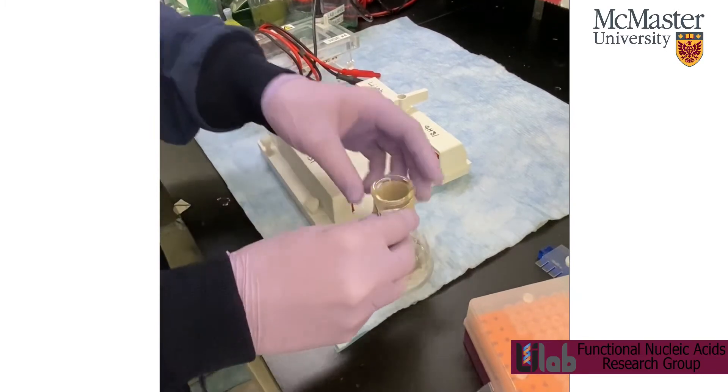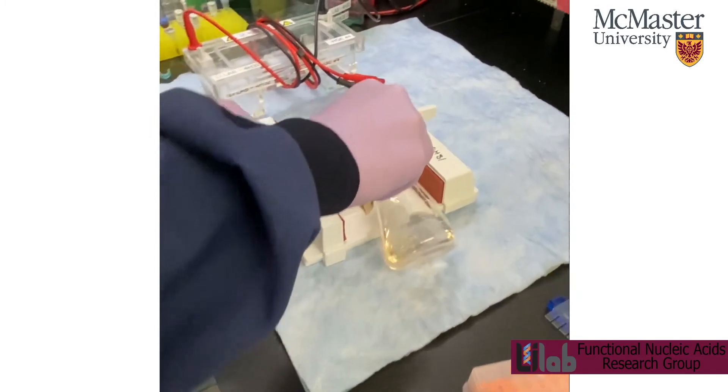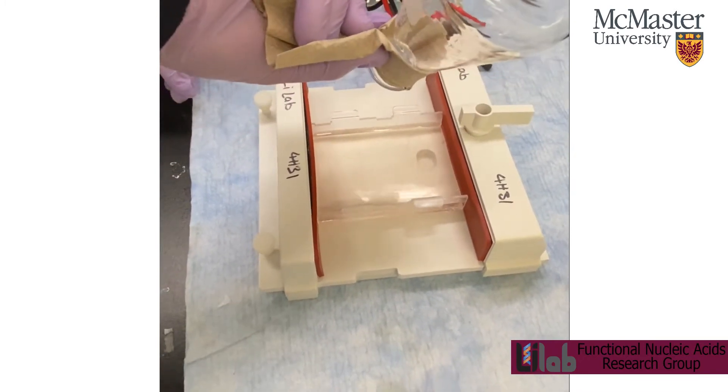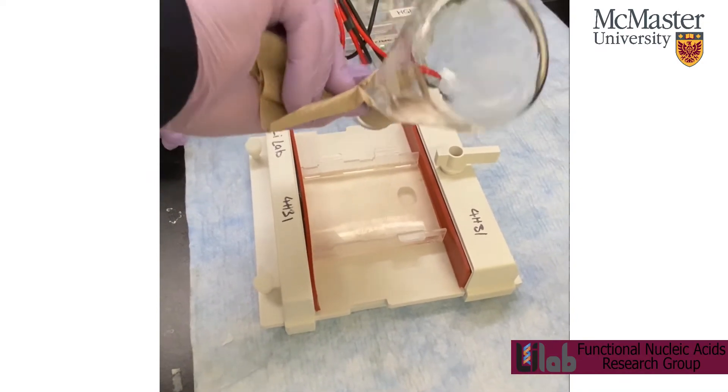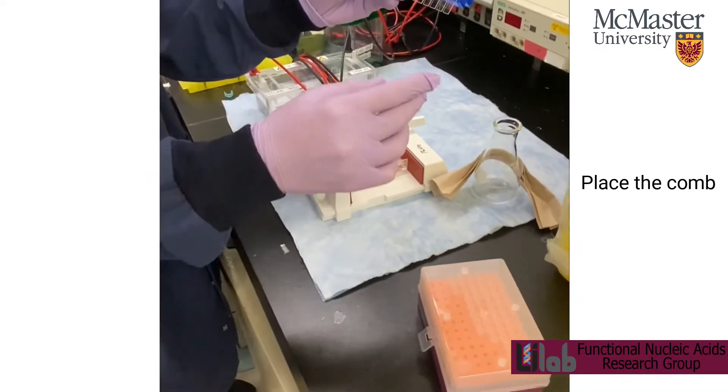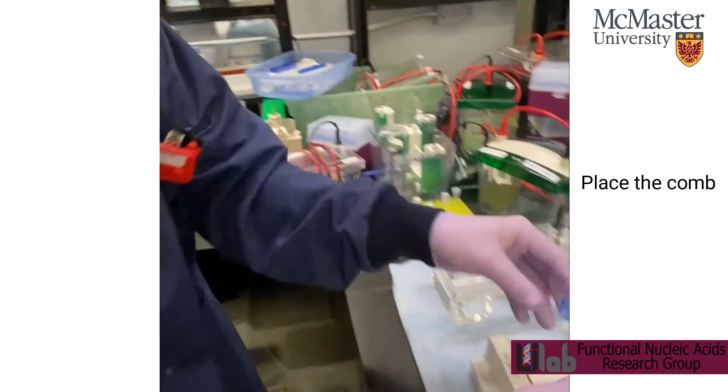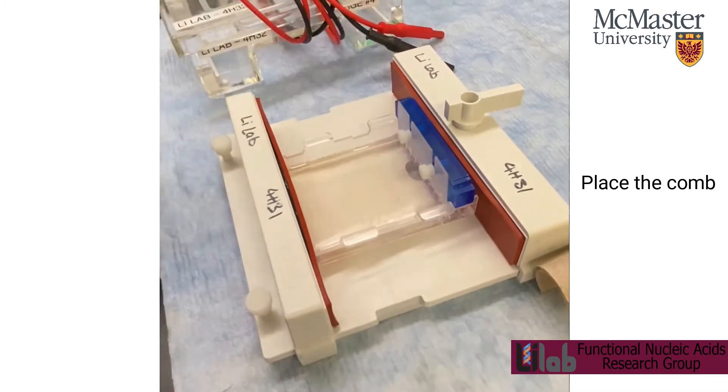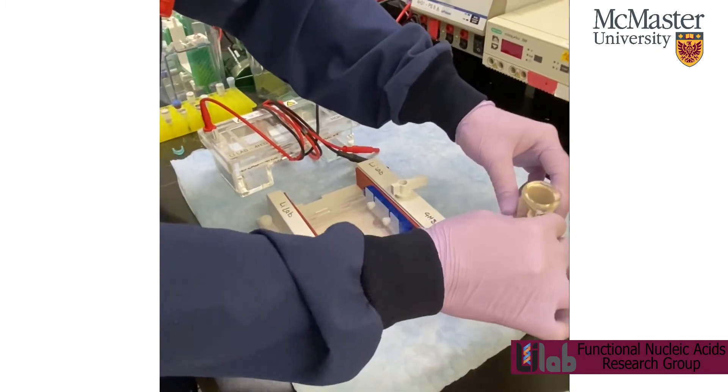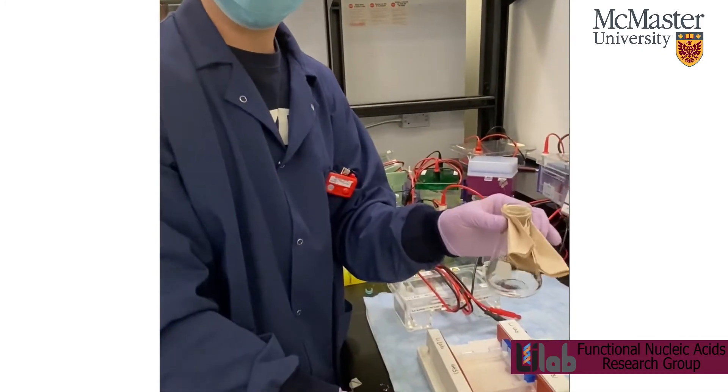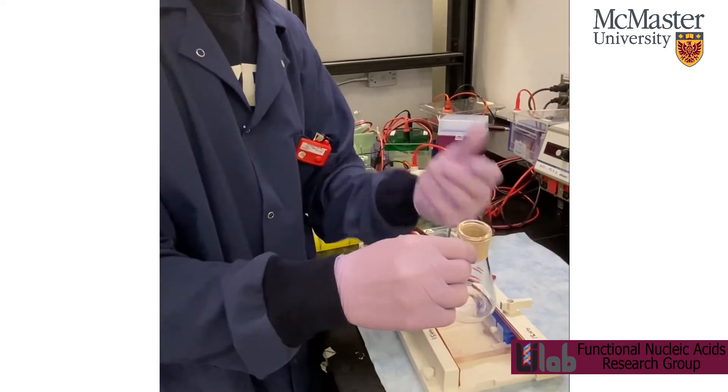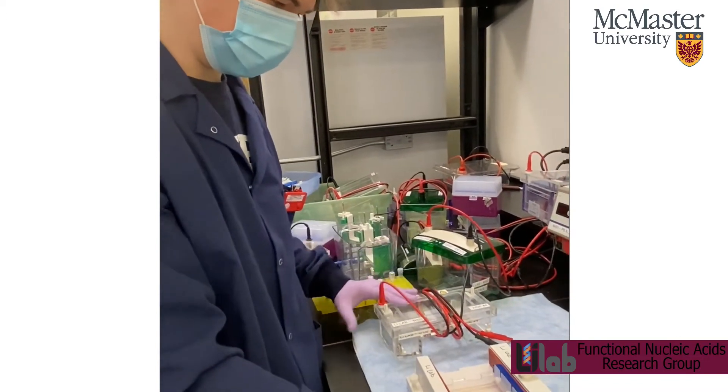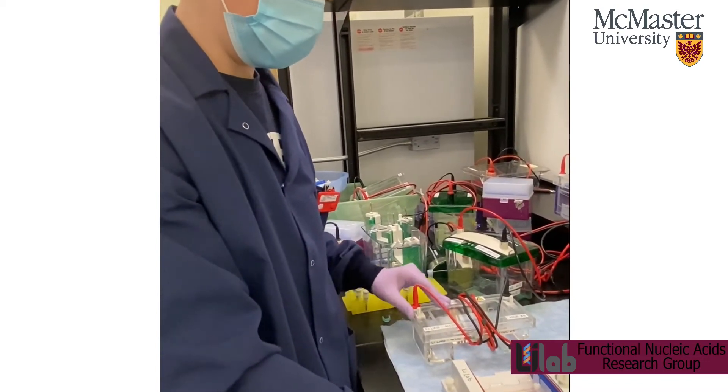So give it a little bit of a mix and then you can pour it in. And then take your comb. There are more combs over here. And just place it in the agarose like that. And then just wait for it to set. You want to wash your flask right away so the agarose doesn't harden in the flask. And then just wait for your gel to solidify. And then you can run it with buffer in the running apparatus.